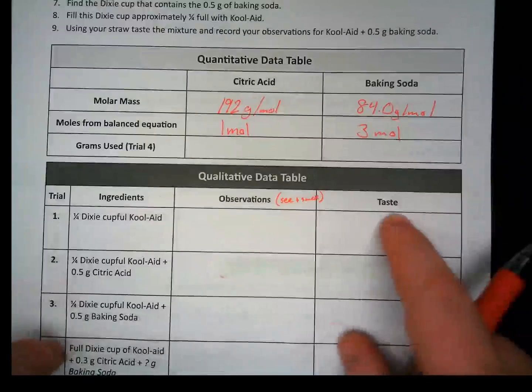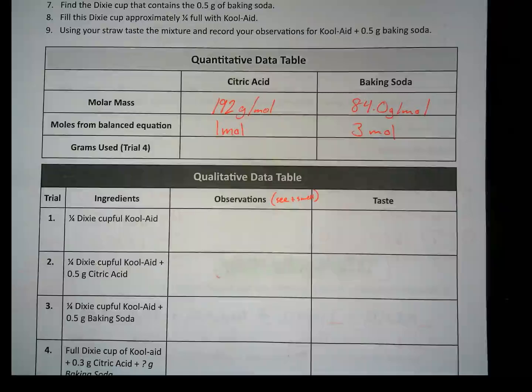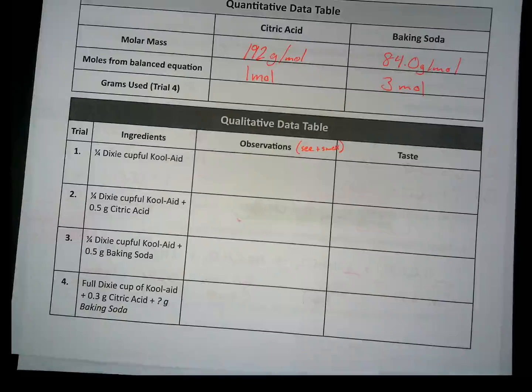And then for the taste, after you're tasting it, you're going to tell me what it is that you taste. Was it sweet? Was it sour? What was the flavor? Was it watery? You're telling me what you thought the taste of it was. That's all you're putting there, and you're going to be doing that for each trial here.